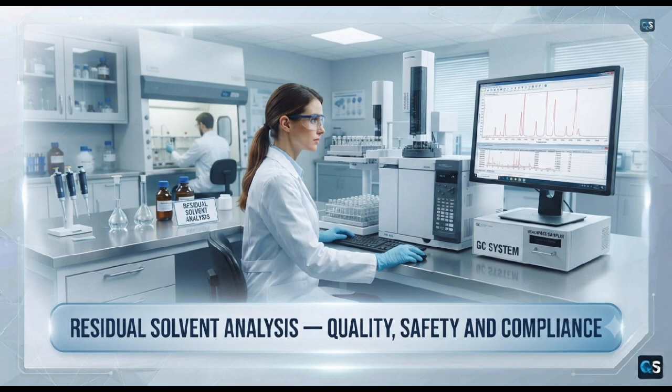Effective control of residual solvents is not simply an analytical requirement, it is an essential part of pharmaceutical quality and patient safety. By understanding these sources, classification, analytical principle, and regulatory expectation, pharmaceutical professionals can ensure reliable control of residual solvent throughout the product life cycle.